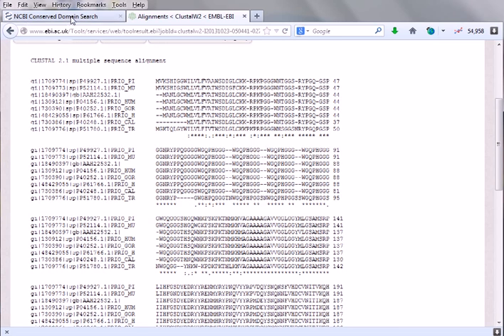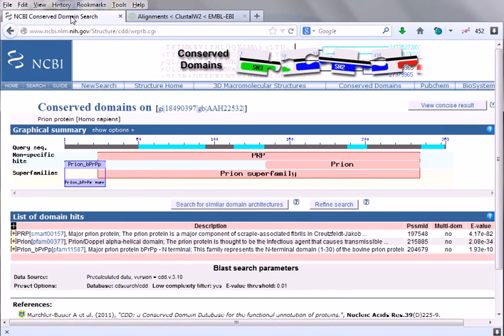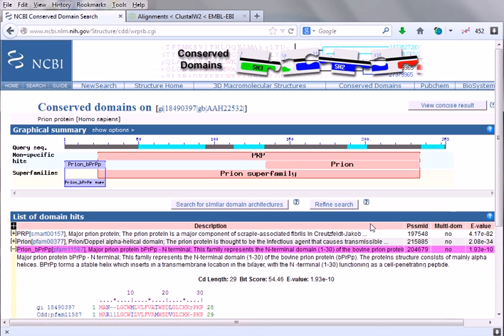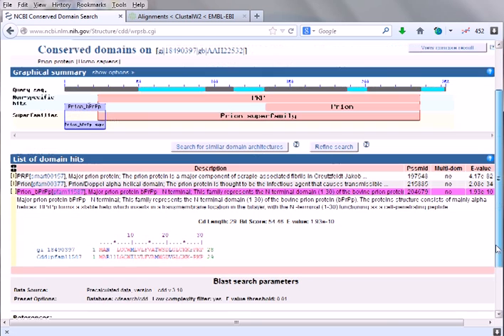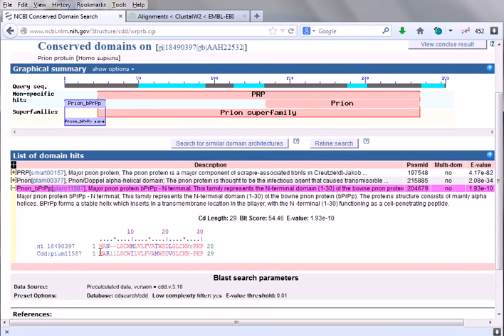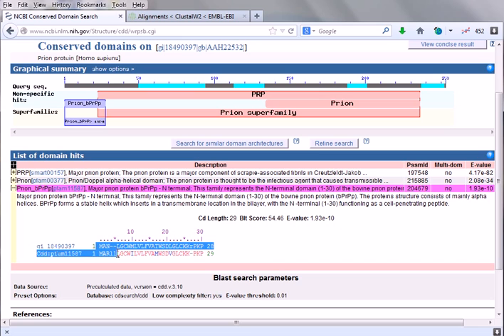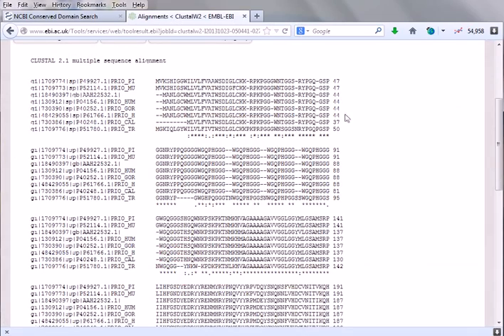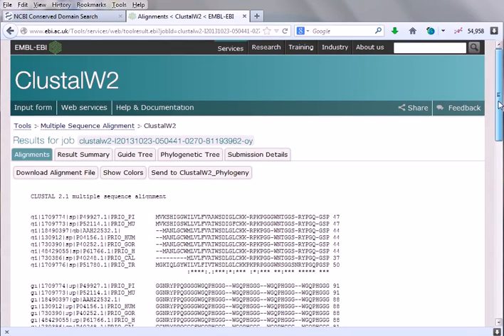We have also seen the conserved domain. If we click the conserved domain earlier, what we found here, the variations are also in the N-terminal domain but not the C-terminal. We can find this N-terminal domain, most of the variations are at this N-terminal. It is tallying with our conserved domain search results. We have seen how to align multiple sequences.